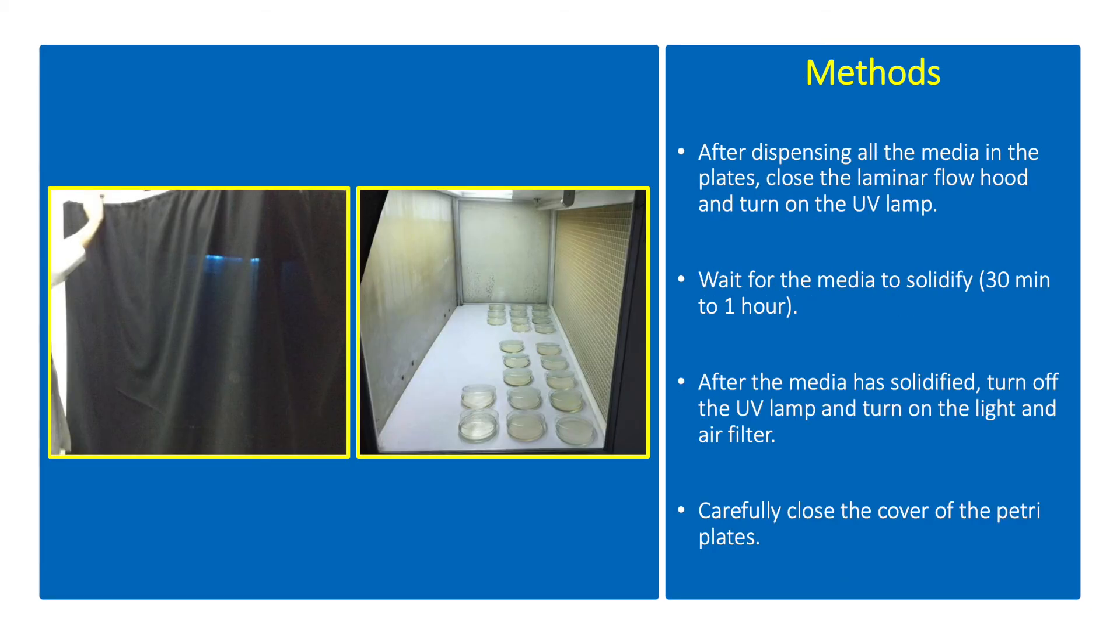After dispensing all the media in the plates, close the laminar flow hood and turn on the UV lamp. Wait for the media to solidify, about 30 minutes to 1 hour.